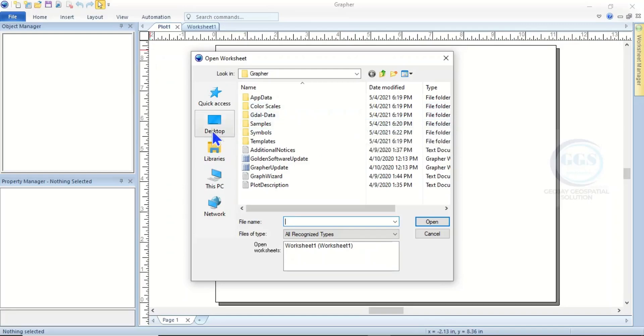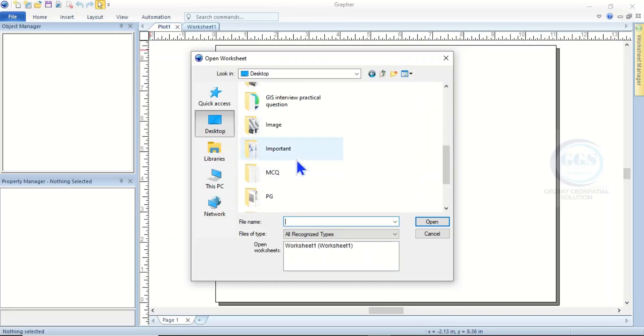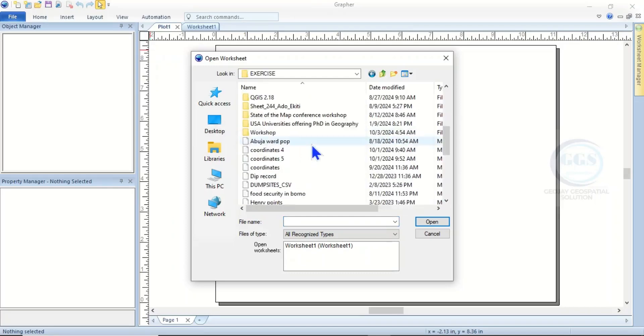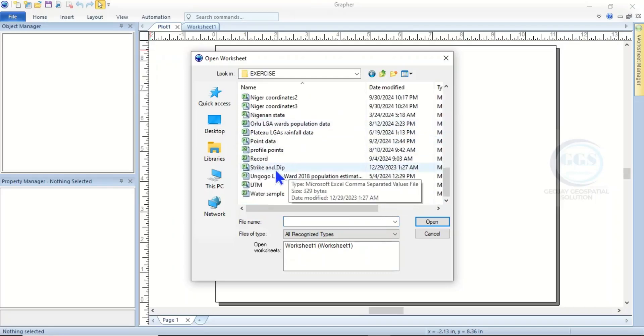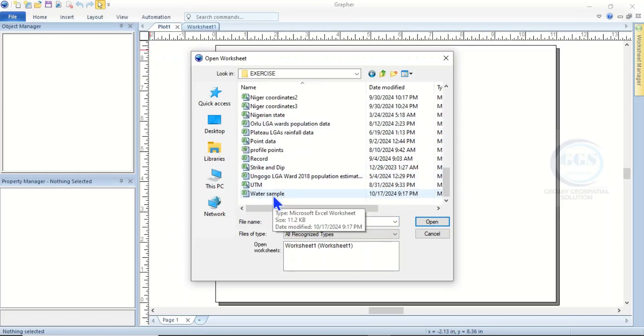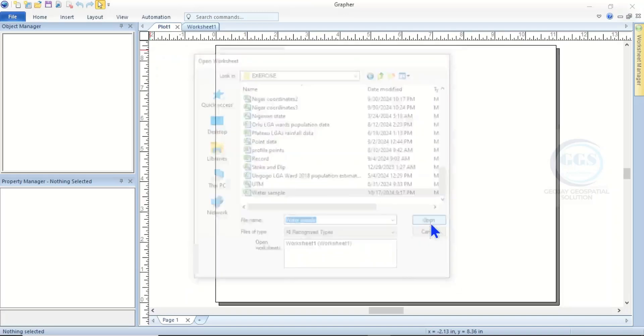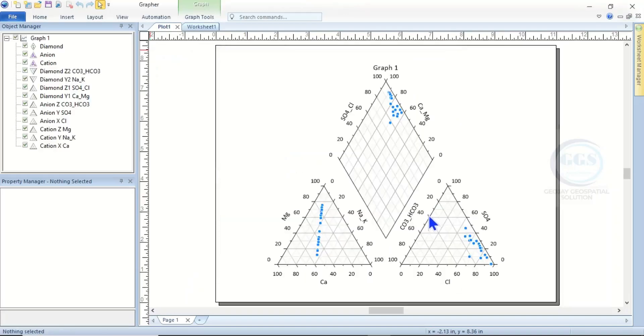Then it will request you to input or bring in the data you want to use. Let's navigate to that folder where we saved our data. We saved it as water sample, and this is it. Click on it and click on Open.